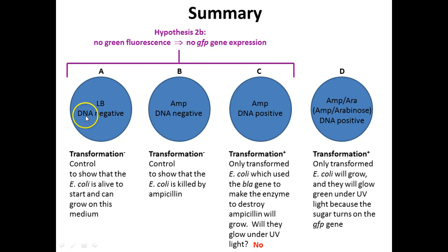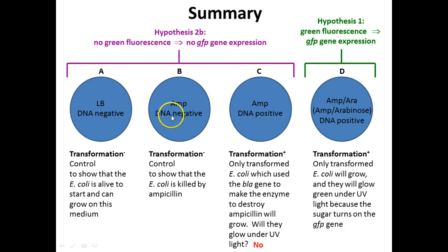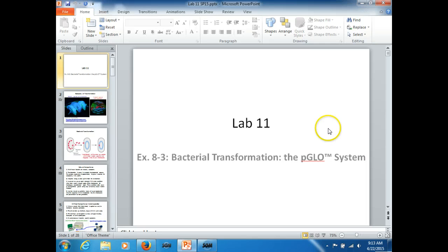Okay, so for these plates, right, there's going to be no fluorescence, which means no expression. But some of these, it'll actually also mean no gene, right? The first two, we didn't even give them the gene. You can't express something you don't have. So definitely no here. Here, right, it's just not expressing it. Here, we should get fluorescence, which means we are expressing the green fluorescent gene. Oops, and that's our last one.